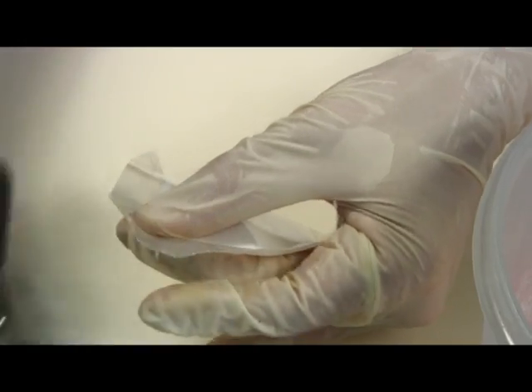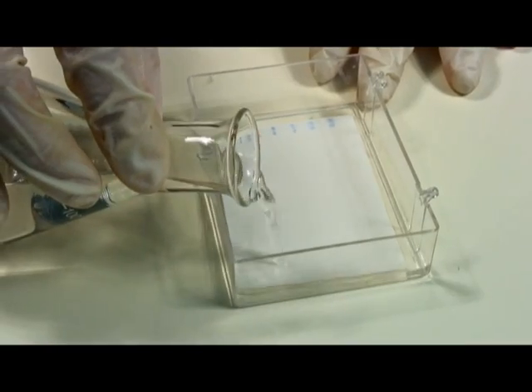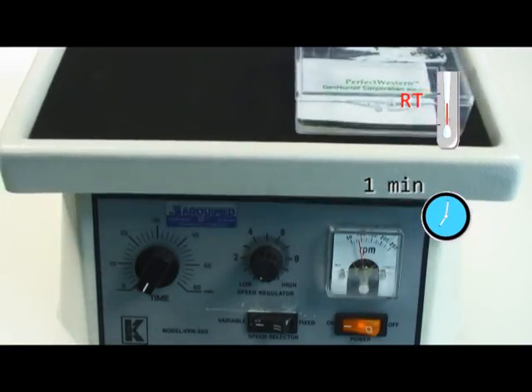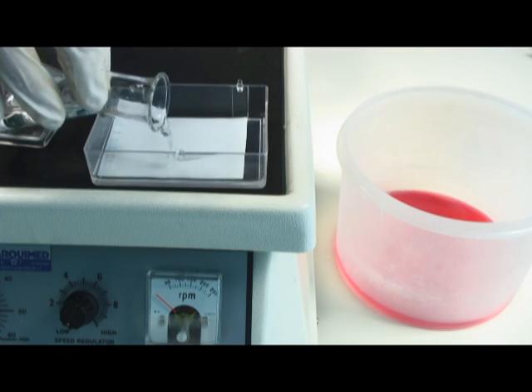Cut the bag and discard the contents. Move the membrane to a container. Wash it in washing solution in a shaker for 1 minute at room temperature. Wash 3 times.